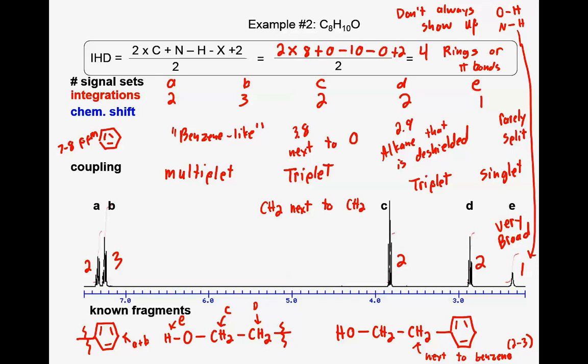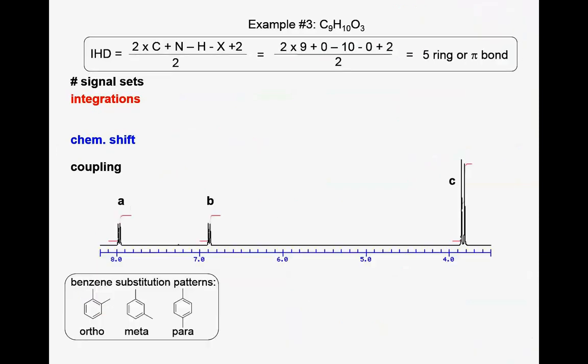And so do we see the 3 non-benzene peaks? Yeah, so benzene smudges together and it doesn't always give you the prettiest picture. So you just do your best with benzene. All right, another example.